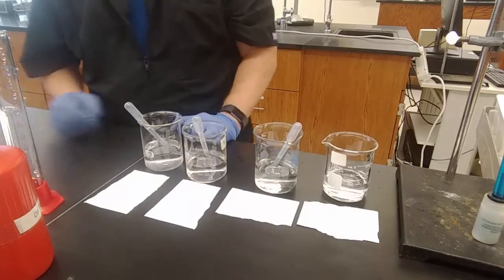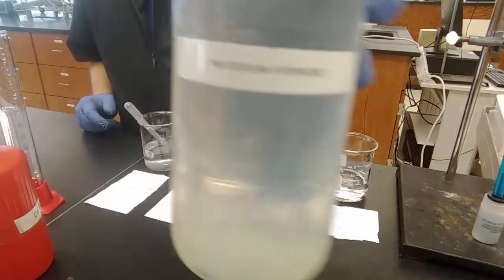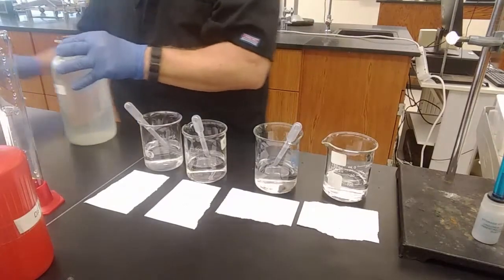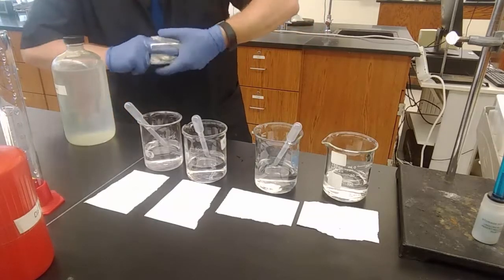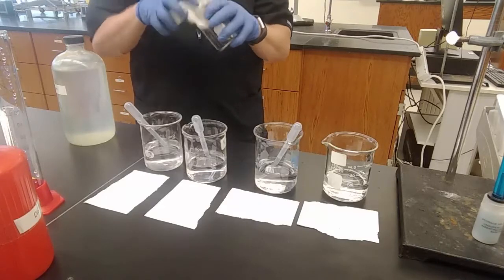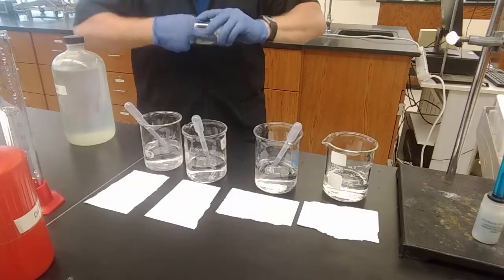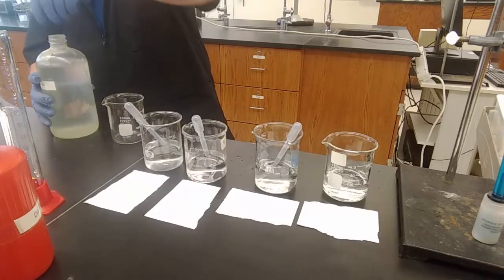About 100 milliliters of our base solution. I have 1 molar sodium hydroxide here. I'm going to put about 100 milliliters of that into yet another 250 milliliter beaker. Since it is a strong base, it is 1 mole per liter Na plus and 1 mole per liter OH minus. Strong electrolyte, going back to the light bulb experiment. And so, it fully ionizes in solution.